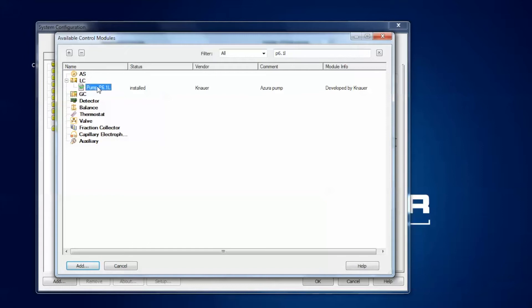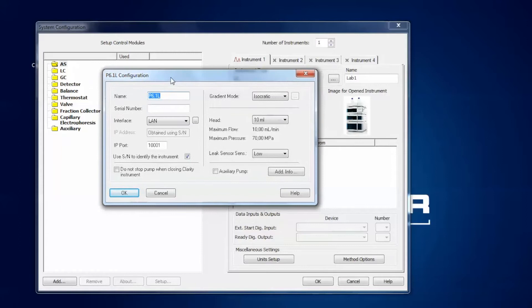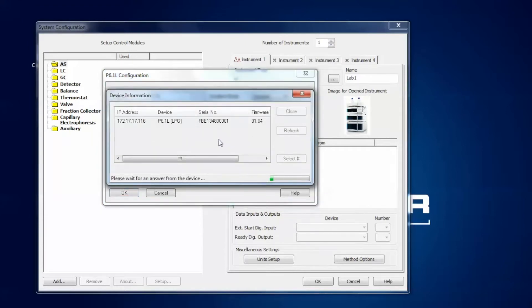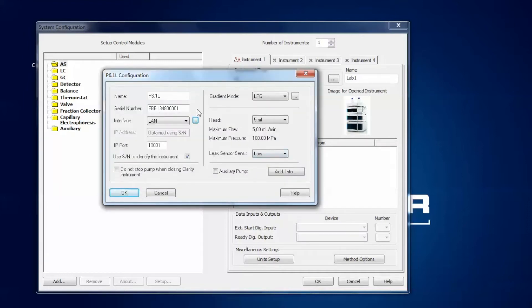Select the device and press the add button and the configuration window pops up. The easiest way to configure your instrument is to use the LAN option and then press the three-dotted button here. The software is now browsing the network and searching for available devices. Once finished, you can click on the P6.1L entry. It gives you the IP address, the serial number, and then you just press select and nearly every setting is automatically transferred.